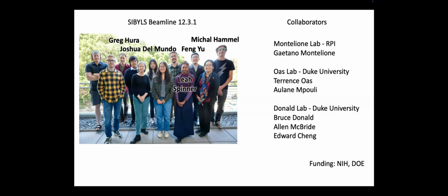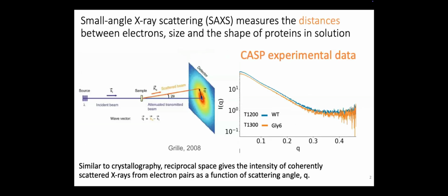Okay, so in the next slide, I just want to get us all on the same page. What is small angle X-ray scattering data?